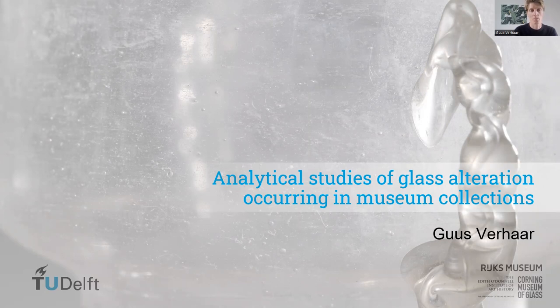I hope that by the end of the presentation, you will have a basic understanding of glass degradation in museum collections, in particular why it is a problem for museums, what we know about it, how analytical studies can help us understand what is going on, and what we still have to learn in order to effectively deal with the problem. My aim is to guide you through the field of glass degradation research by providing you with the necessary background before outlining the specific research goal of the collaborative project.